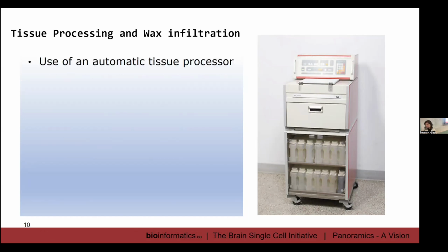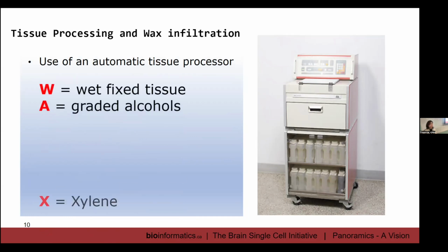So, of course, that's what that is. And we're going to remember this acronym, WAX. If you remember the word WAX, it's tissue processing in a nutshell.